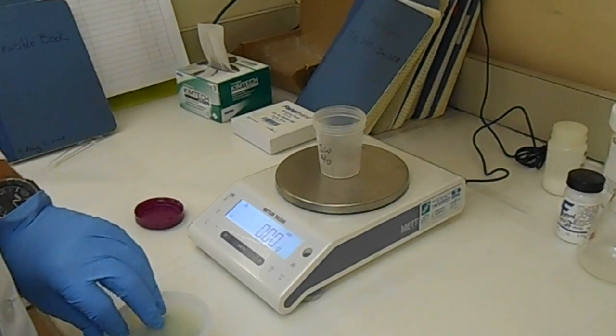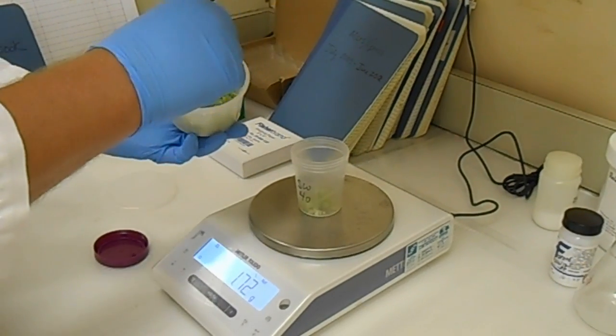The next step of the test, we're going to weigh five grams into the specimen cup, and we'll also weigh five grams into the small mason jar.